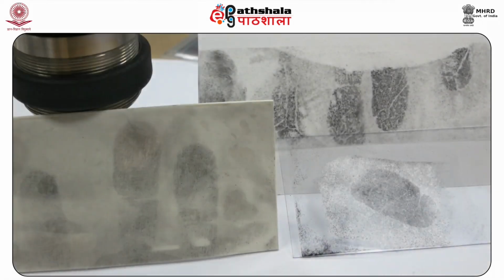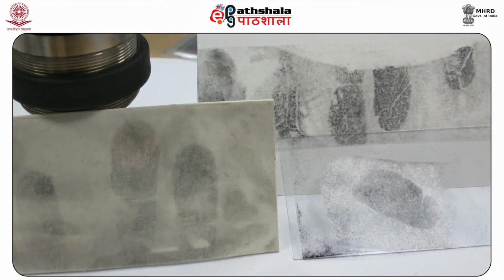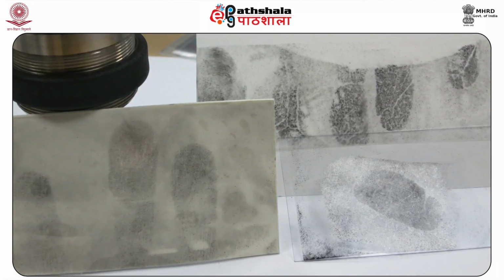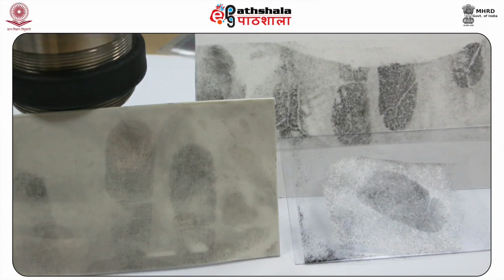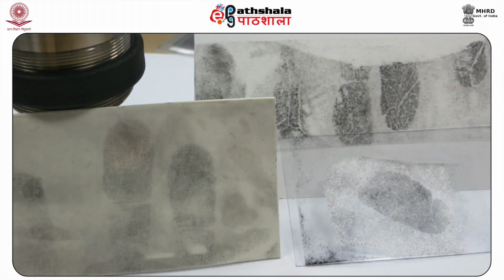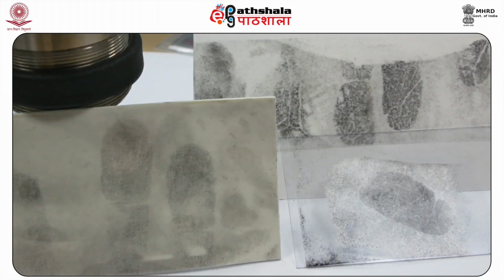On porous materials, a reaction occurs between the lipids, fats, oils, and waxes found in sebaceous sweat and the silver based liquid reagent known as physical developer to produce a silver gray deposit visible to the naked eye.